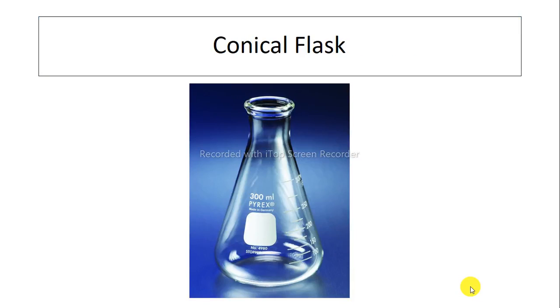This is a conical flask. You all know this is used for titration purposes, where the volume is marked. The base of this conical flask is such that whatever reactions happen, the base will provide a higher surface area.